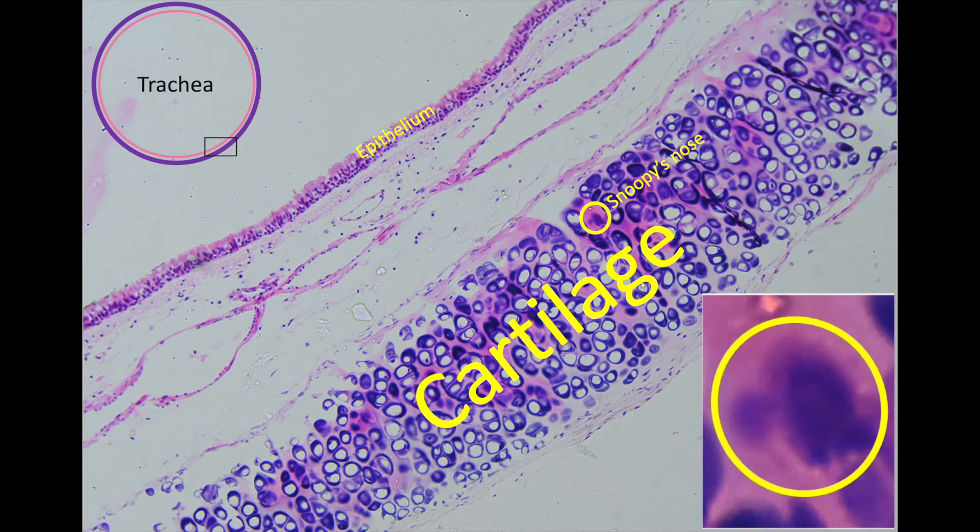To make comparisons between scopes and lenses, I have to focus equally, so I use unique, highly detailed, memorable features to set the focus. This one I call Snoopy's nose — it consists of two dots, the nose and the snout, as Snoopy is looking to the left. These dots are in close proximity, really at about the limit of resolution. So I know I'm focused when I see these two separate dots, the nose and the snout of Snoopy.